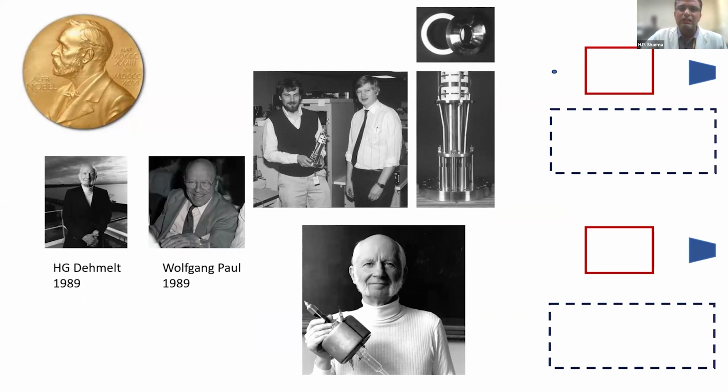The mass spectrometer which I have is a 6500 plus QTRAP. So it has a trap function, and I know that when you apply this trap, you see differences. If a molecule is going, then you get a signal. The other molecule enters and you get a signal.